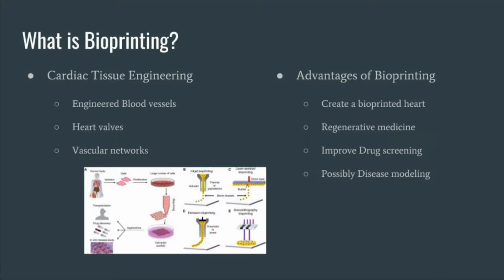So what is bio 3D printing? 3D printing is a process that varies, but material is ultimately just joined together by a computer in order to create three-dimensional structures. This tactic involves kind of a tedious process, but it can also be explained somewhat simply. For this process, in order to recreate material, the printer needs something to copy.